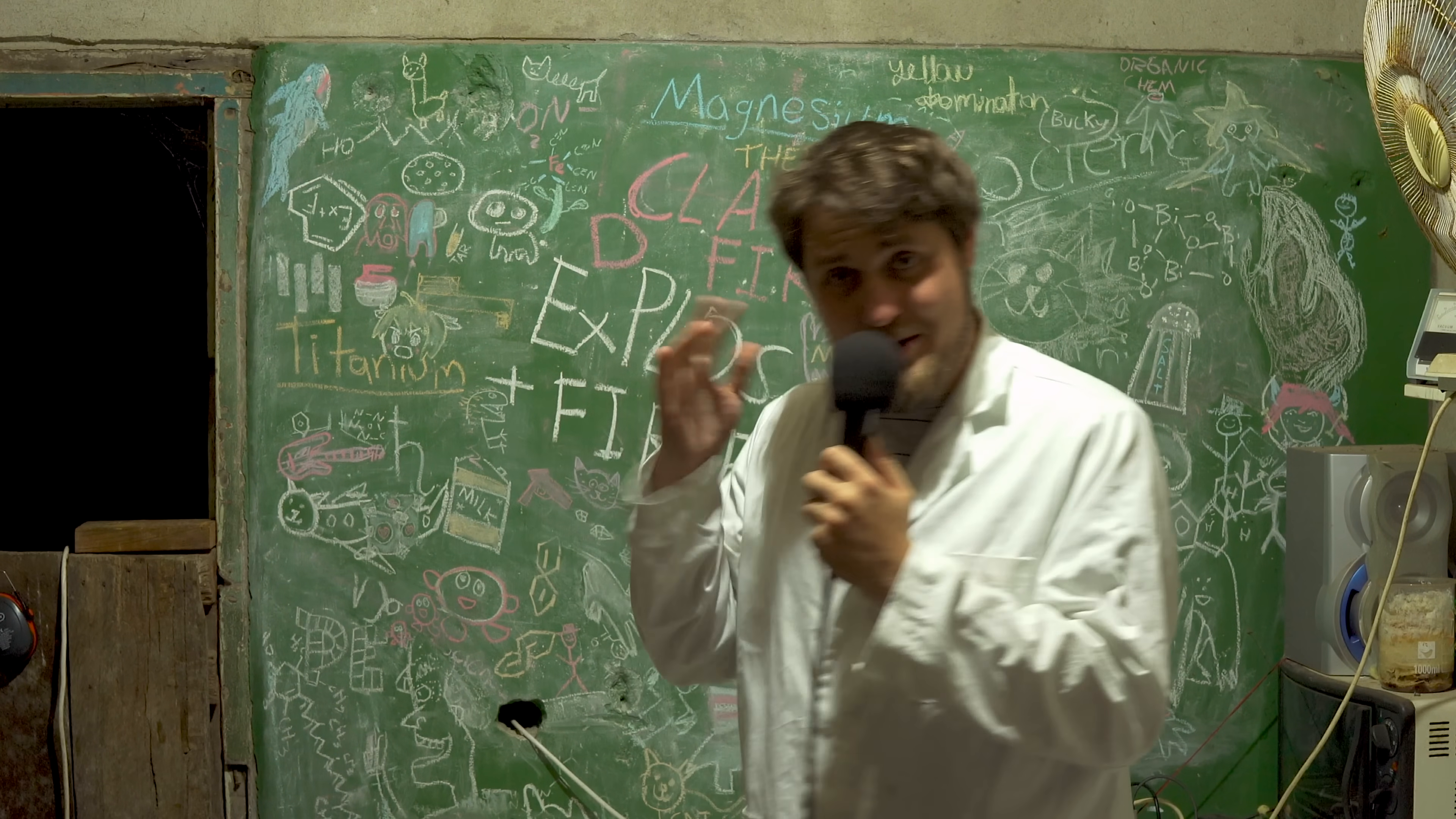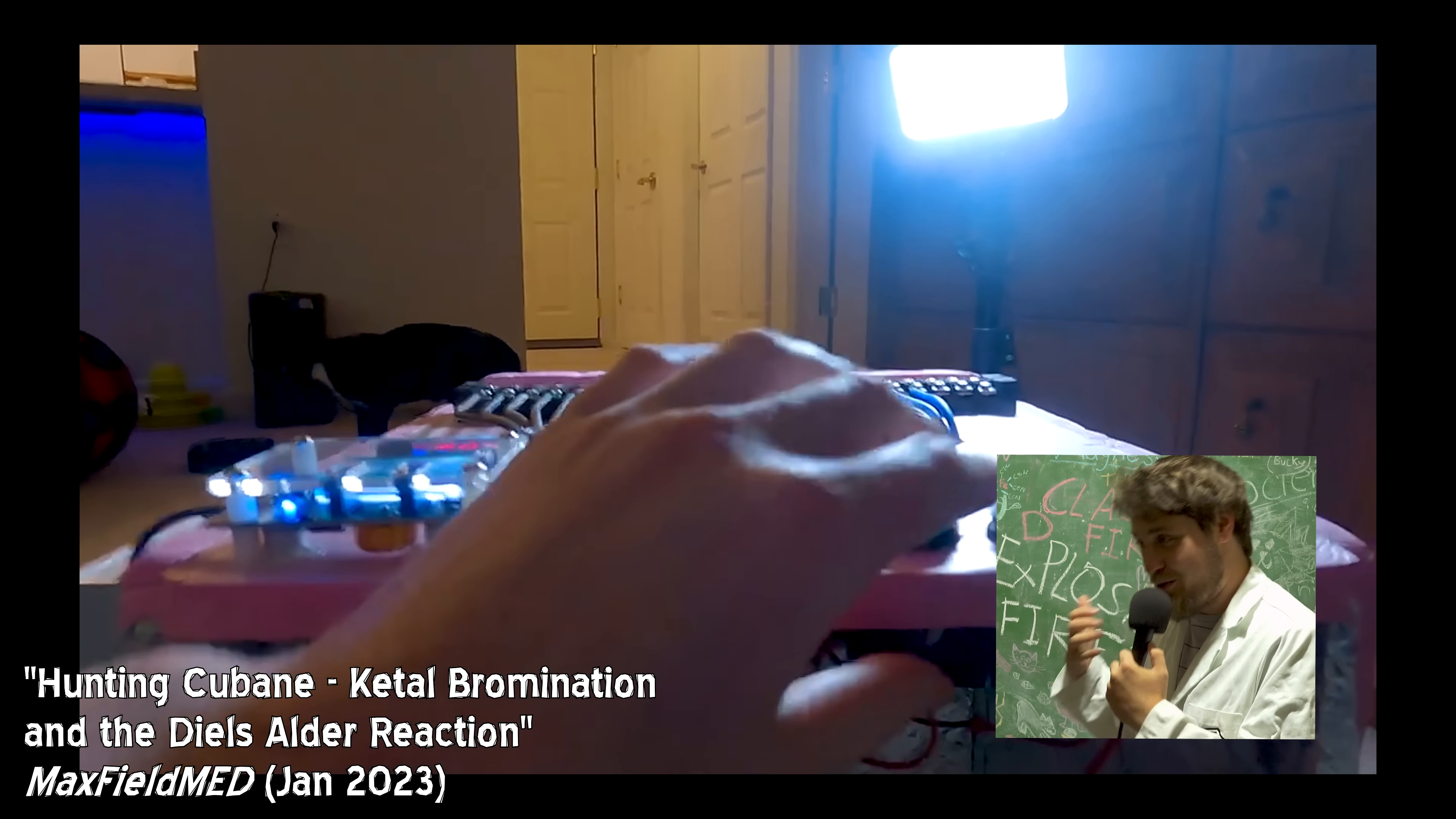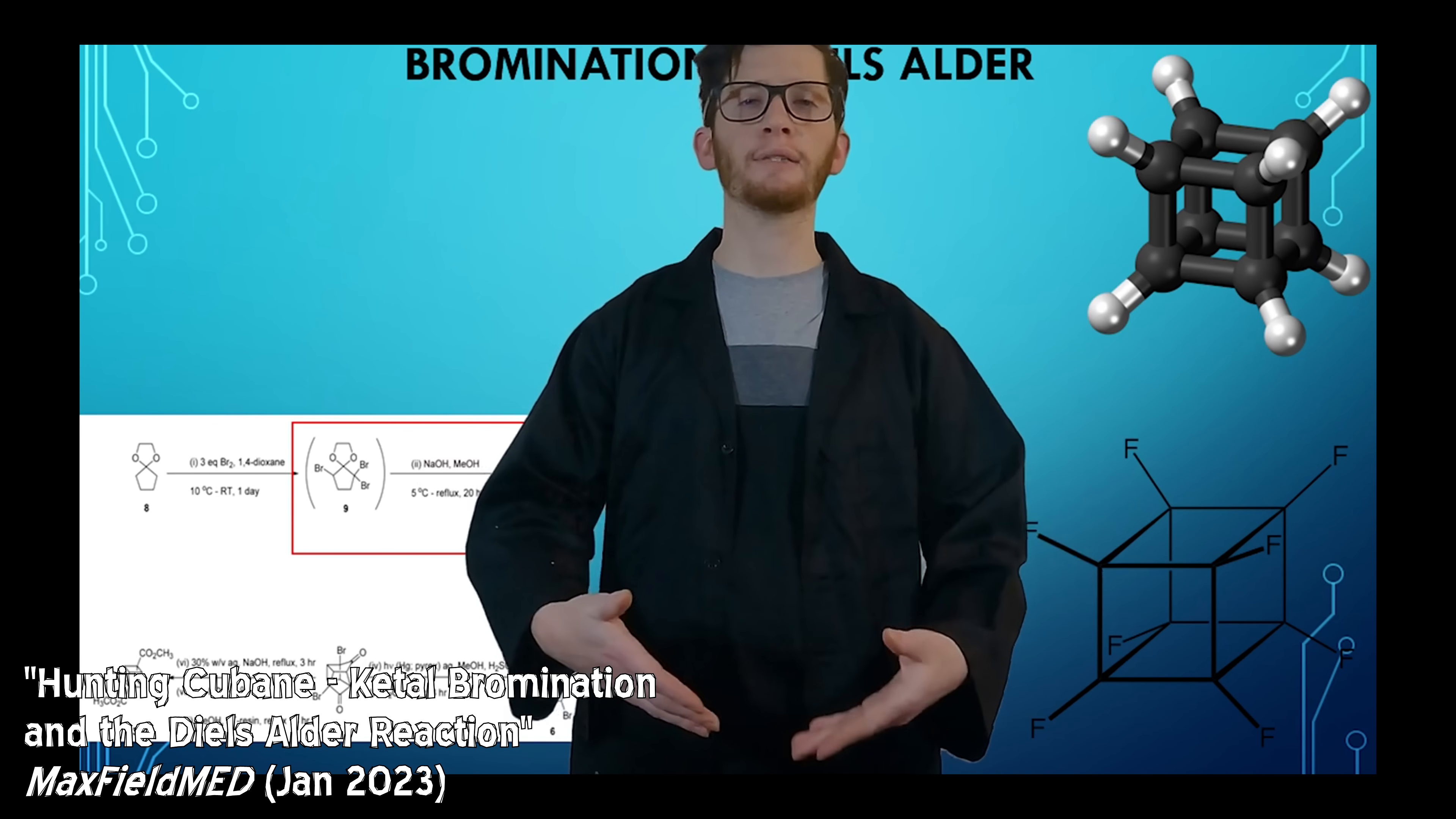And the second really cool thing that he's doing experimentally is about the photochemistry step. Now, he's not really up to the point of attempting the photochemistry step, but really early on, he built a sort of photochemistry reactor which he will eventually use. Like me, he sort of decided that 310 nanometer LEDs were a cool pathway to go down. But rather than having it as just one big batch trying to shine the light through, he wanted to do it as sort of a flow setup. I'm going to be turning it into a flow reactor as well. So I bought a peristaltic pump and FEP tubing for the UV light to pass through.